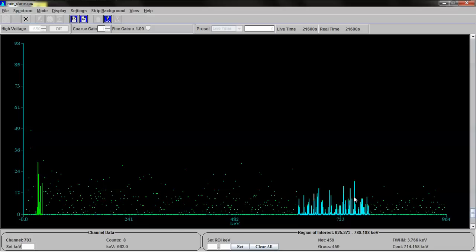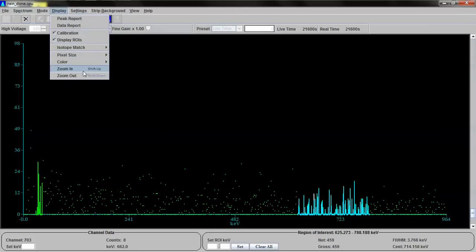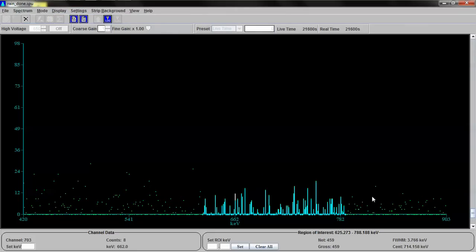Let's zoom in. Let's see, how do we zoom in? Okay, I can't remember how to zoom in. Zoom. Shift up. Okay, well, there you go.